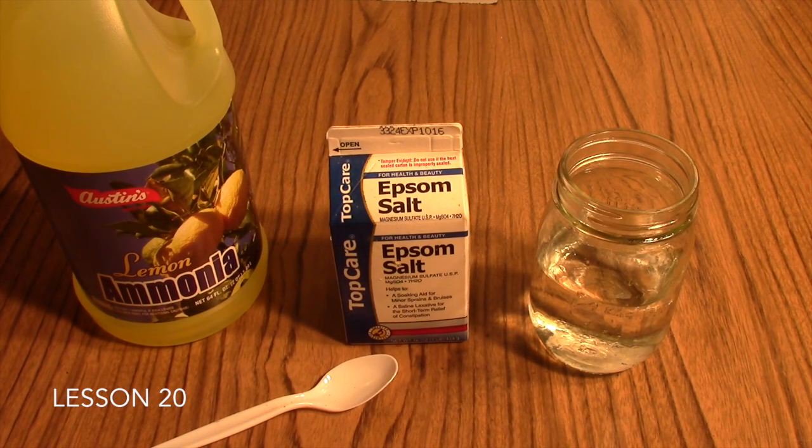This is the Formation of a Precipitate lab, which goes with Lesson 20 in your Friendly Chemistry course. The purpose of this lab is to allow your students to witness that a chemical reaction has taken place due to the presence of a precipitate.